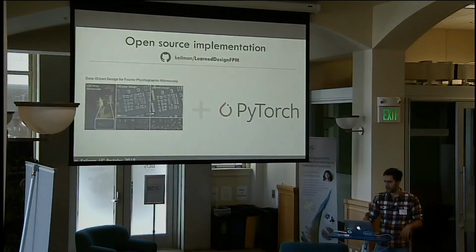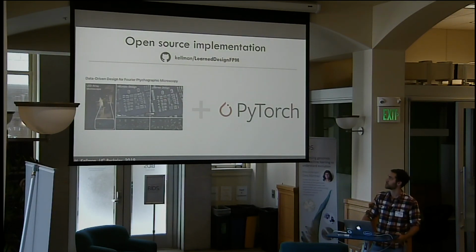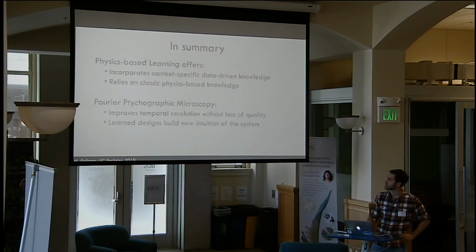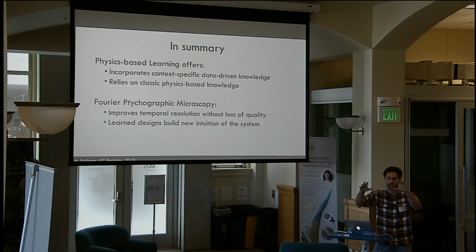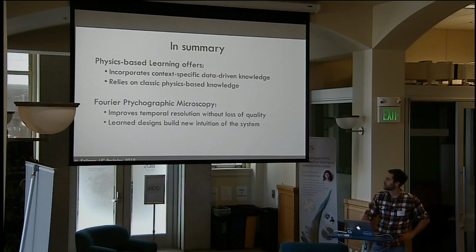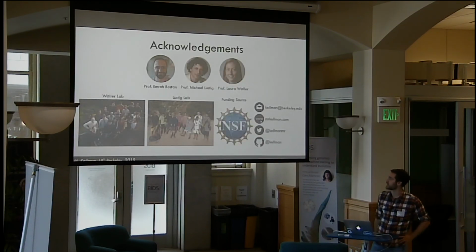With that, all of this research and information is reproducible and implemented in PyTorch and available open source on my website and GitHub. And I'd like to highlight these physics-based learning methods, which incorporate conventional knowledge as well as knowledge from the data. It enables us to learn how to reduce the number of measurements required for microscopy in this application. With that, I'd like to thank my collaborators, my labs, and all of you for listening. Yeah, thank you.